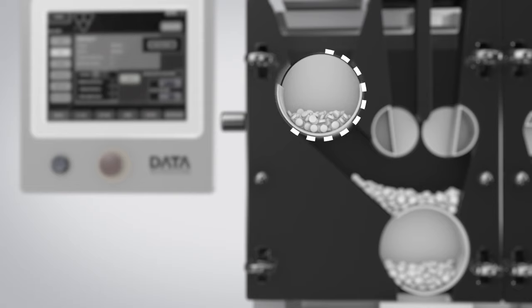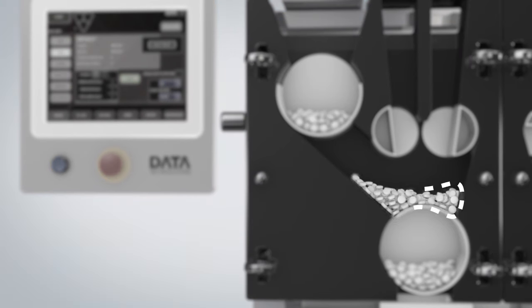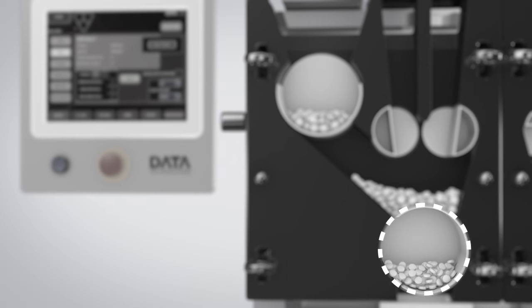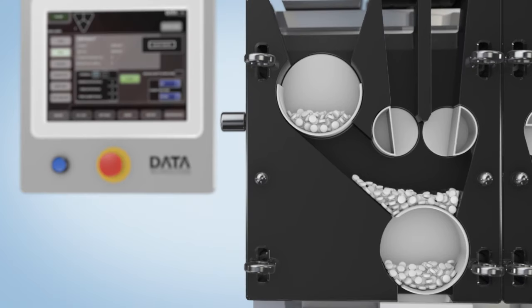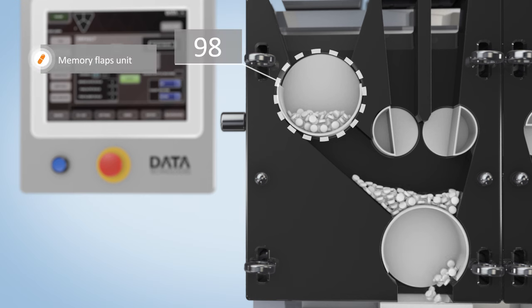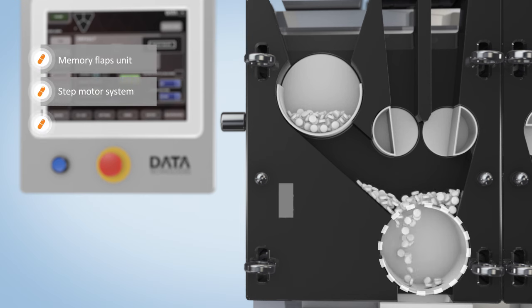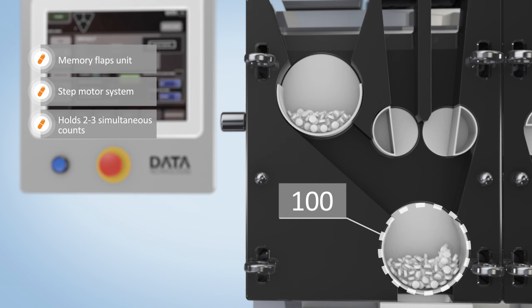The ICU memory flap unit holds up to three counts, ready for filling at any given moment. Based on an advanced algorithm, all system units work in parallel, optimizing performance and throughput. Unique magnetic flap connections minimize dust effects.